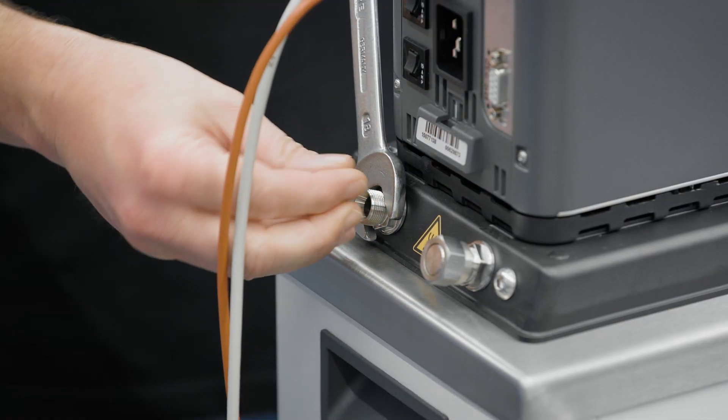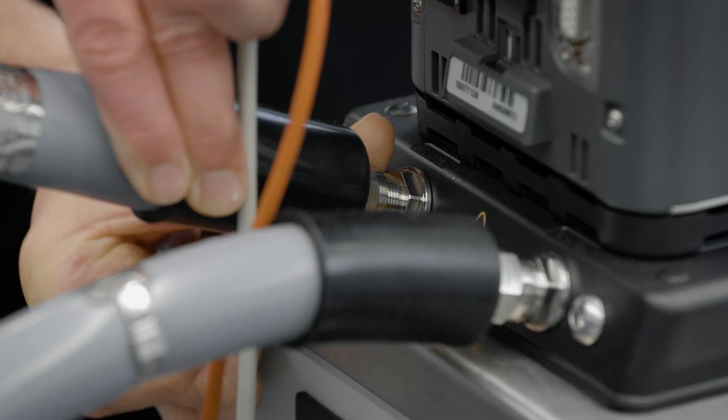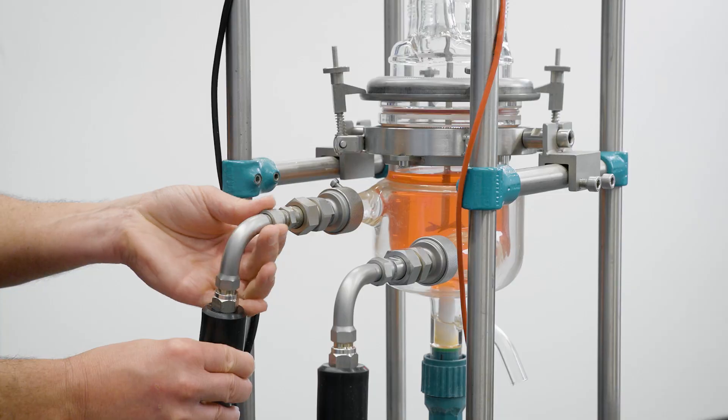To connect the reactor tubes, simply loosen the two nuts with a wrench and connect them with a maximum torque of 3 Nm to the Dyneu. The output is always connected to the lower connection of the reactor or external recipient, and the input to the upper connection. In this way, any possible air in the system will be able to escape correctly.